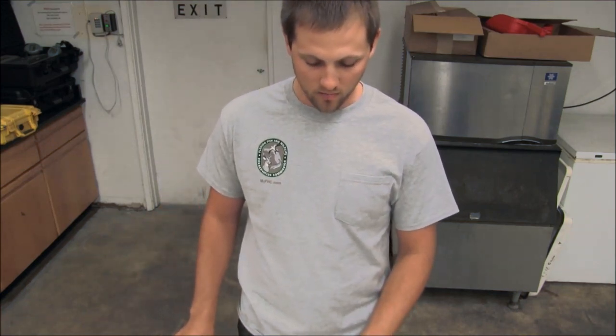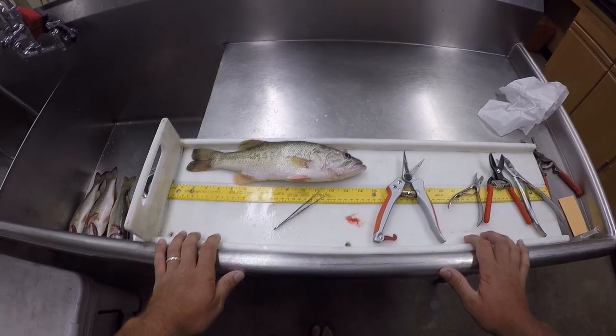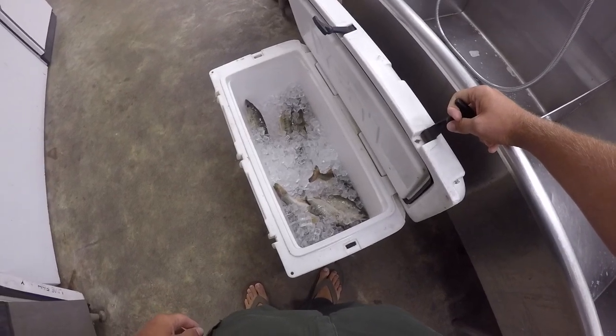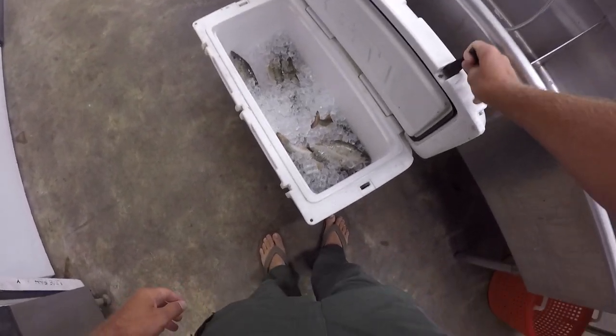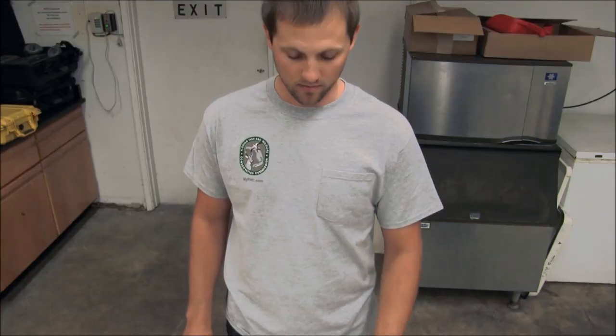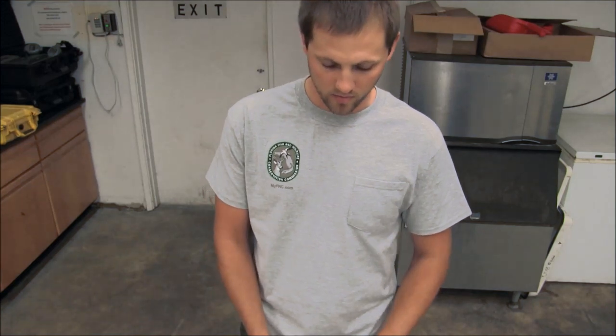A quick helpful hint: when you're planning on doing this, you really want to make sure ideally that your fish are fairly fresh and on hard ice and really chilled well. It'll keep everything fairly clean and it won't make quite as much of a mess when you're trying to do this.